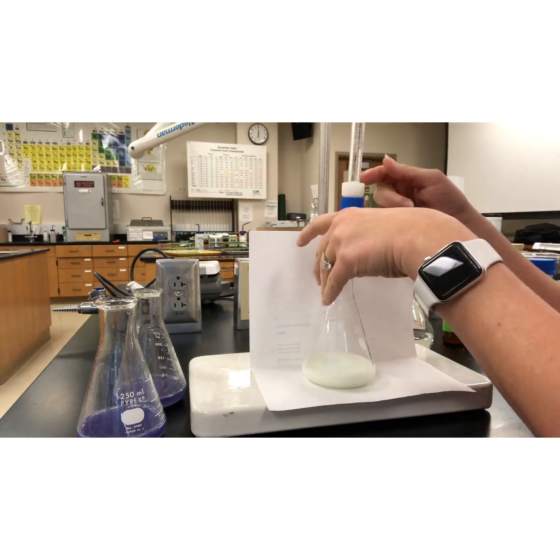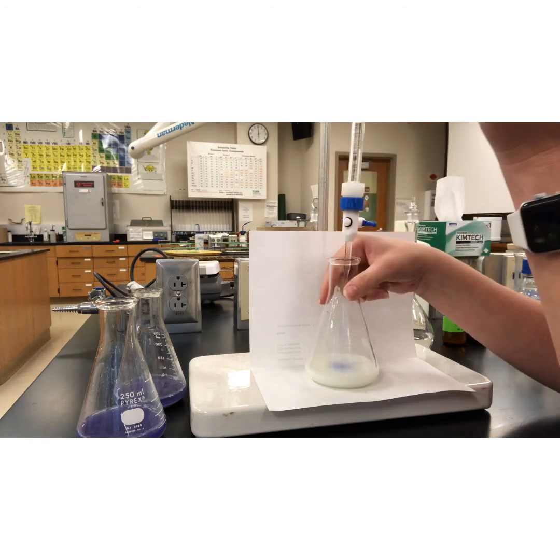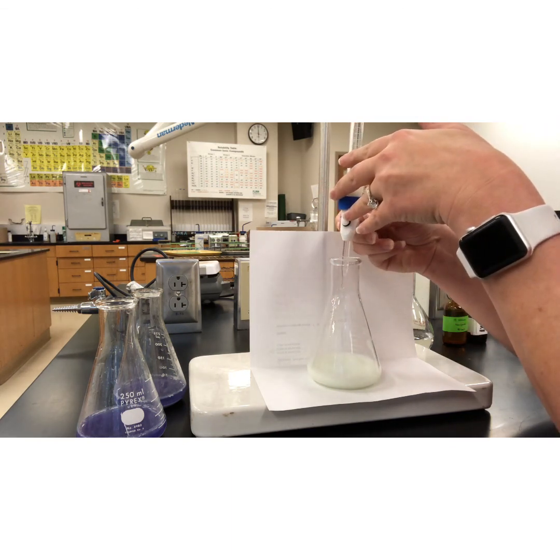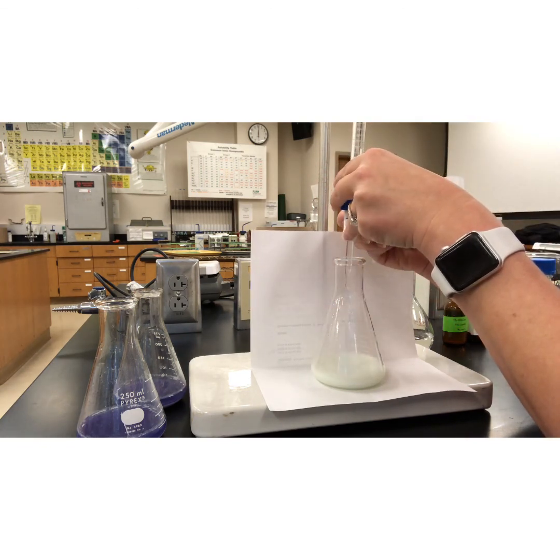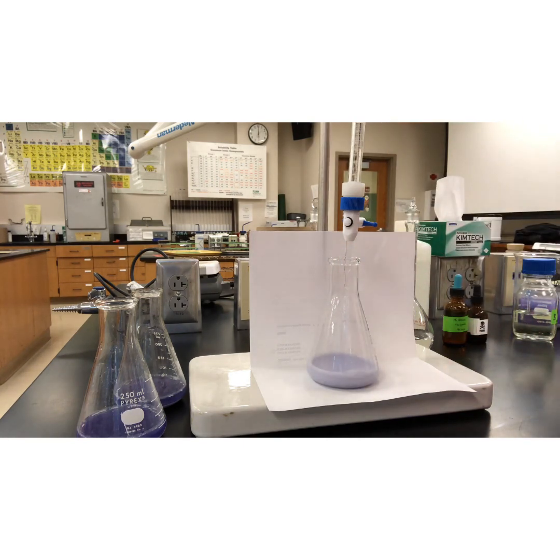Just a drop in there. Just a little bit. The fainter the color change, the closer you are to that endpoint. All right, definitely have our color change there. Turned it a little farther than I wanted to, but hey, it happens.